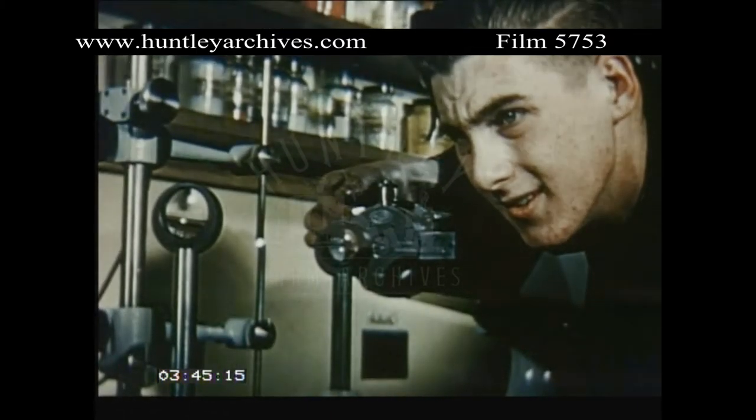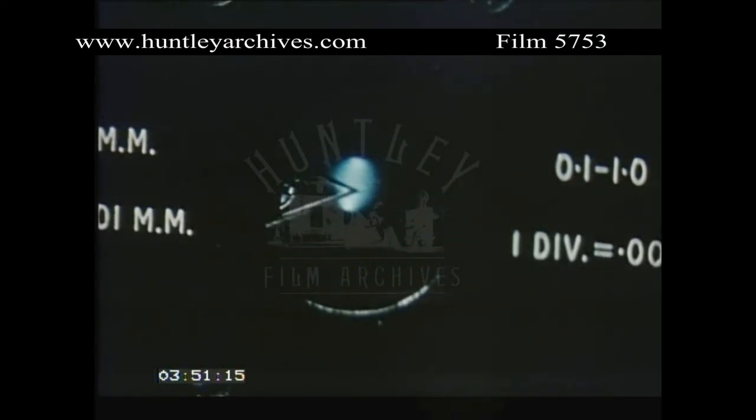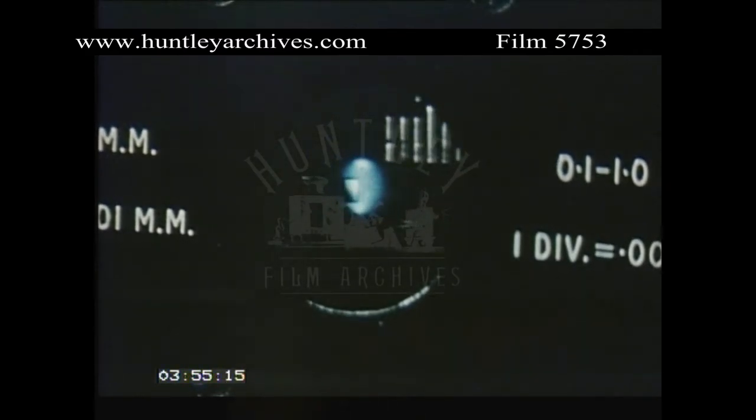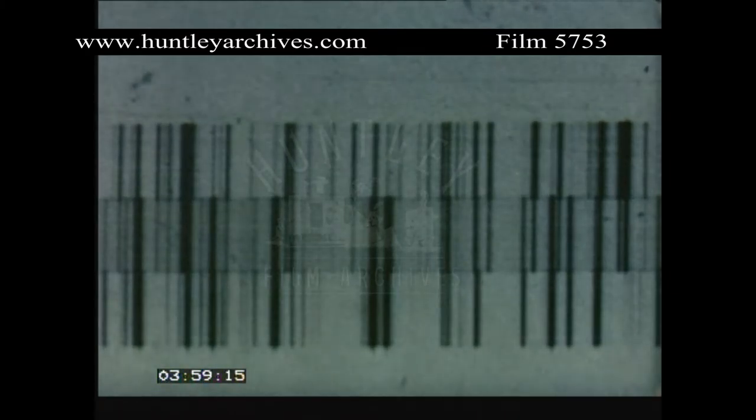Many spectrographs are fitted with a device for comparing spectra. Sliding this Hartmann diaphragm across the slit, three spectra in turn are recorded. In the resulting spectrogram, the three spectra overlap slightly and can be easily compared.